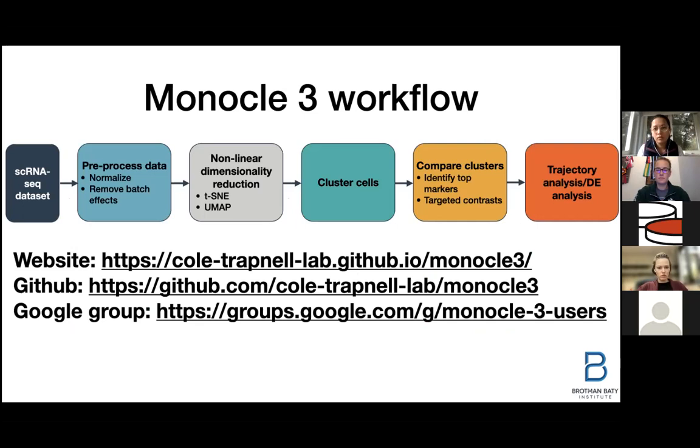So the general workflow of Monocle is this. Today we're going to start with a single cell data set, which is that one cell data set object that I shared with you. The reason why I share just one sample for these tutorials is for the sake of time, because really large data sets take a huge time to process, and we would just be waiting and waiting. So just to show you how the general pipeline works, a small sample, I think, is a good example.